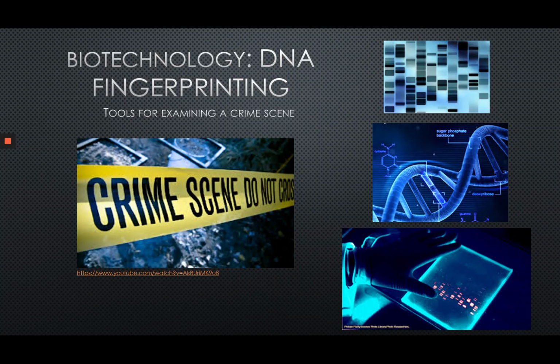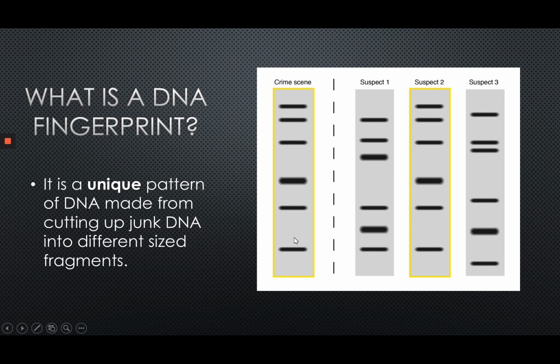Hey there everyone. In today's class we're going to look at DNA fingerprinting. This is the last of the biotechnology series for genetics, and I thought that it would be a good idea to at least go through a little bit about DNA fingerprinting in terms of what it is, how it's made, how do we analyze a DNA fingerprint. So let's start by looking at what is a DNA fingerprint.